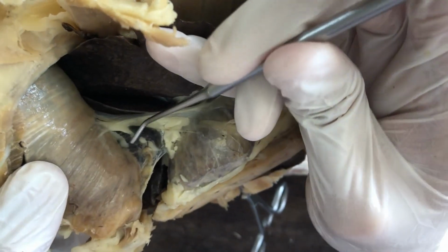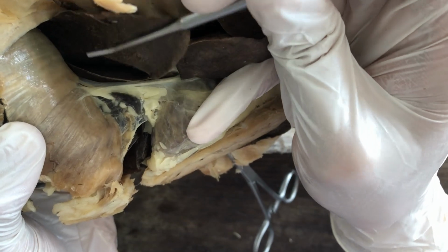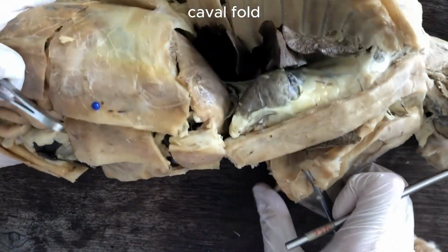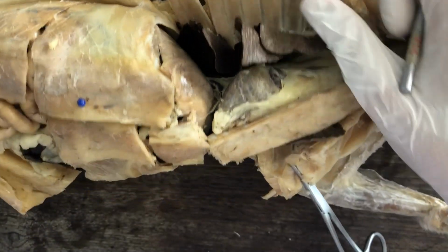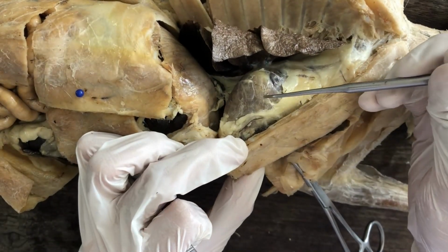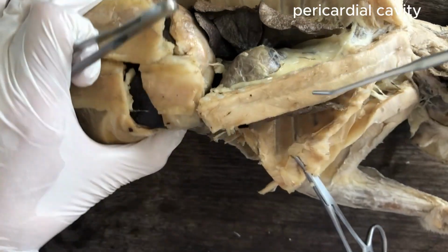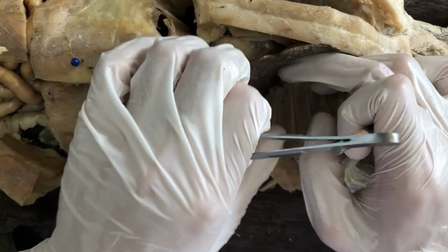And that connective tissue that initially covers the medial lobule is actually the caval fold. But we'll get to that when I make a video on the mesenteries and the coelomic cavities. But that's the medial lobule. And another prominent structure is of course the heart. This is the heart, tucked inside its own cavity, which is the pericardial cavity, separate from the right and left pleural cavity.